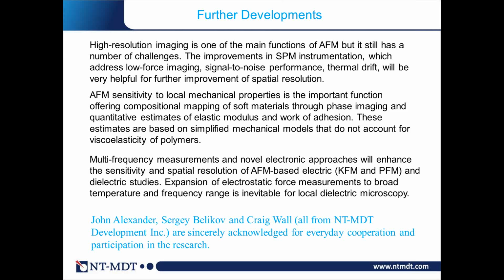You need to know the level of deformation you apply for the mechanical measurements, because only then can you justify if you apply non-dissipative models to do that.